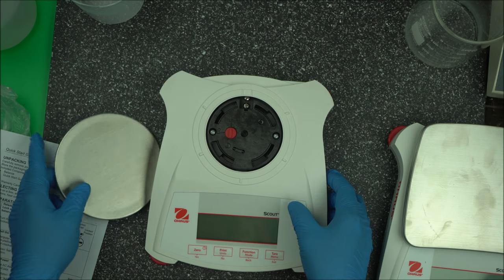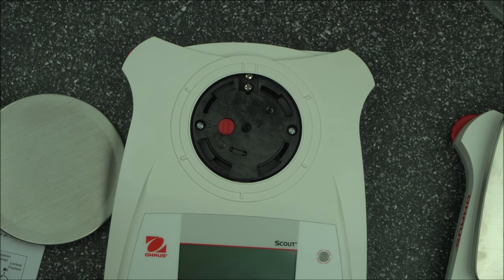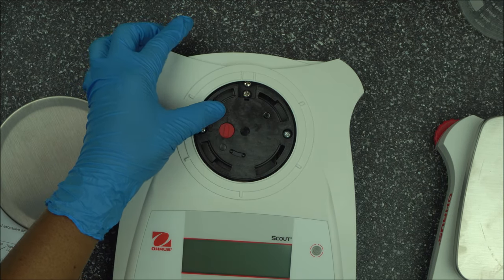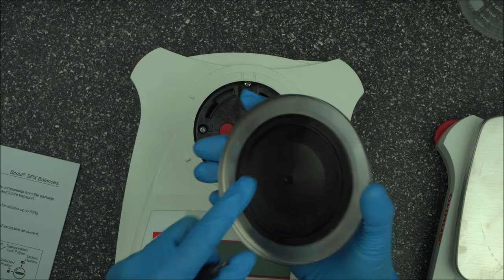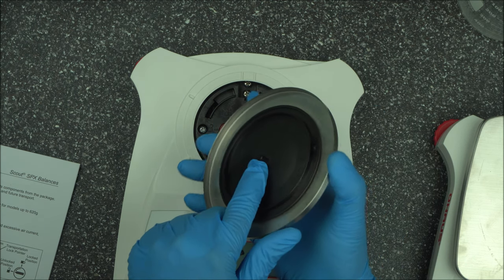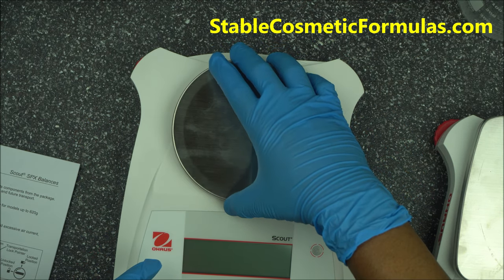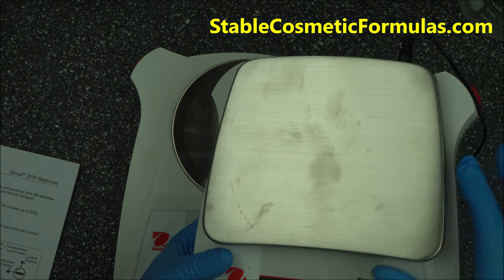The first thing you want to do is turn this knob — let me zoom in so you can see. Right now it's in the locked position. Turn the red arrow to the unlocked position. Then take the round pan and plug it in here — it's not going to click, just leave it like that.